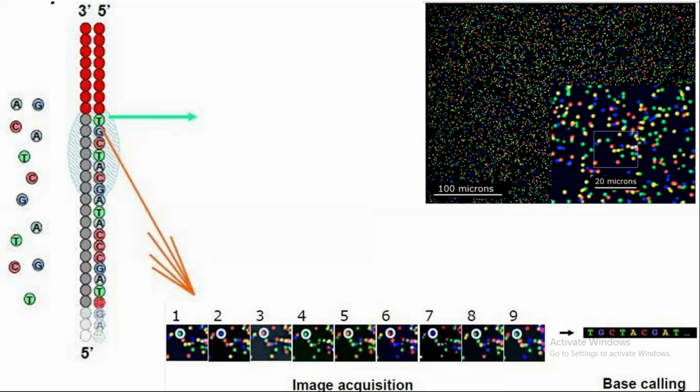The laser is scanning it, and then the reads are written in the sequencing files. For example, if we look at this specific point, the green fluorescence is thymine, after that it is guanine, cytosine, thymine, adenine, cytosine. So a single FASTQ file is being generated, and inside the FASTQ file, sequence number 1 is being generated. The scanner, which is the laser here, is scanning it and detecting the fluorescence.